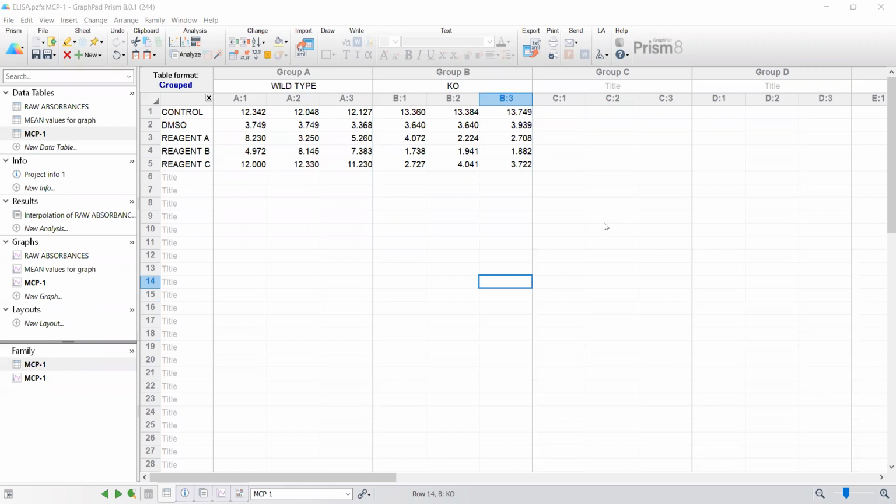Welcome back. In this video, I'm trying to show you how you can make a statistical analysis based on the data that you have. In GraphPad, there are two options to do this. If you just made a figure, for example, by an ELISA, and you want to make sure that that difference, what you see, is really significant or not.